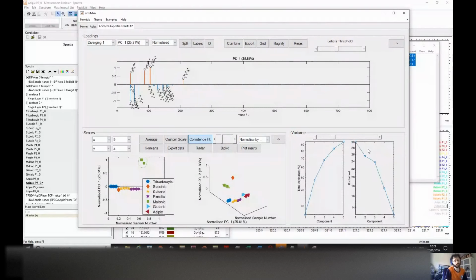As I said last week, it's ordered in terms of the variance. So obviously the first PC will always show the highest explained variance, and then it decreases from the high ones until it's really close to 0.